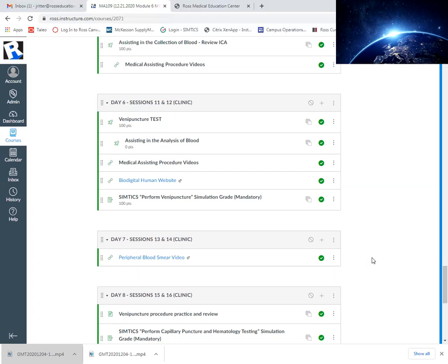You will need the microscopes in this module. Just get out a few. I think it's always interesting to have the instructor create a slide of blood with a cover slip so that students can see the actual blood cells moving around. Students will also be creating their blood smears, and it's kind of fun for them to look at that smear, that slide under the microscope.